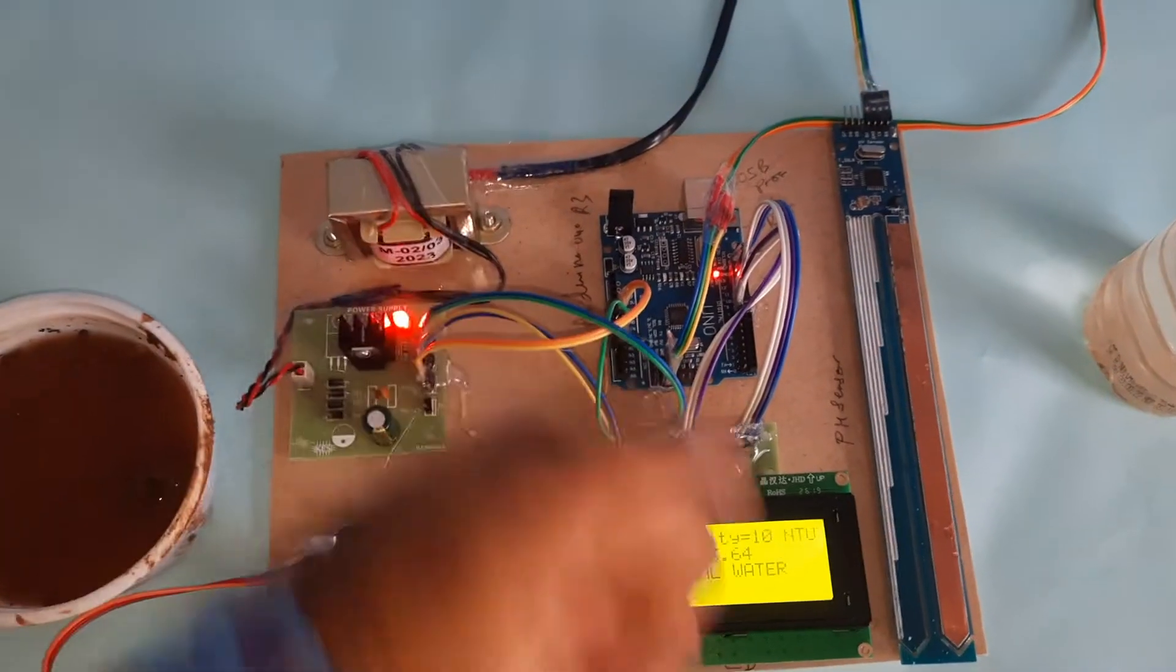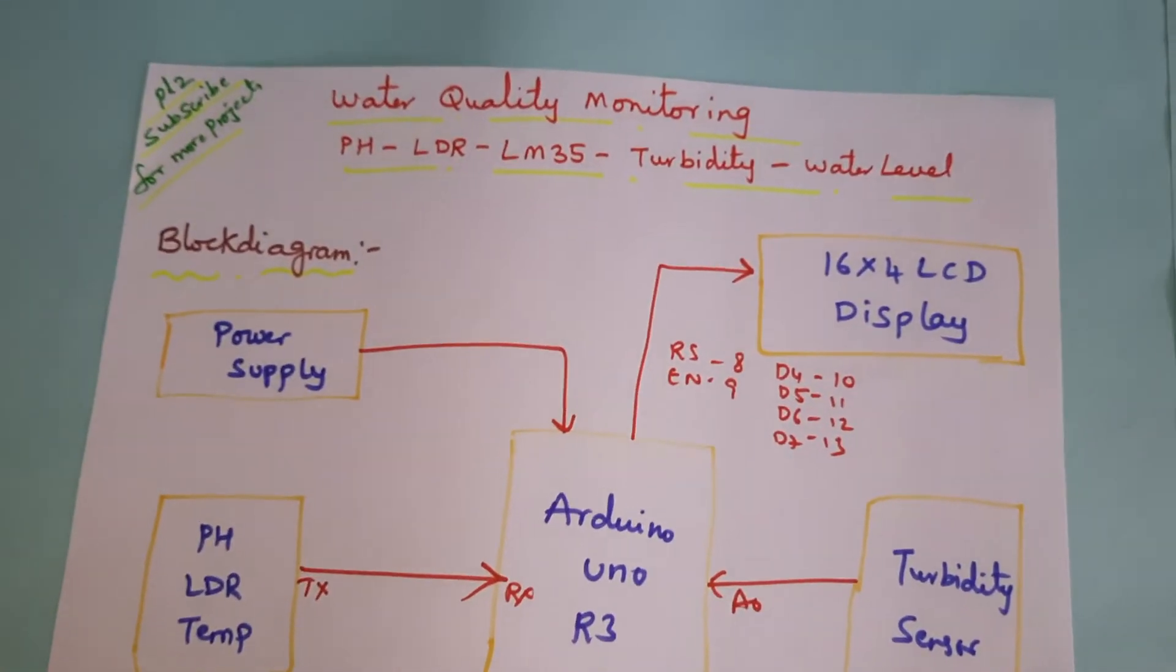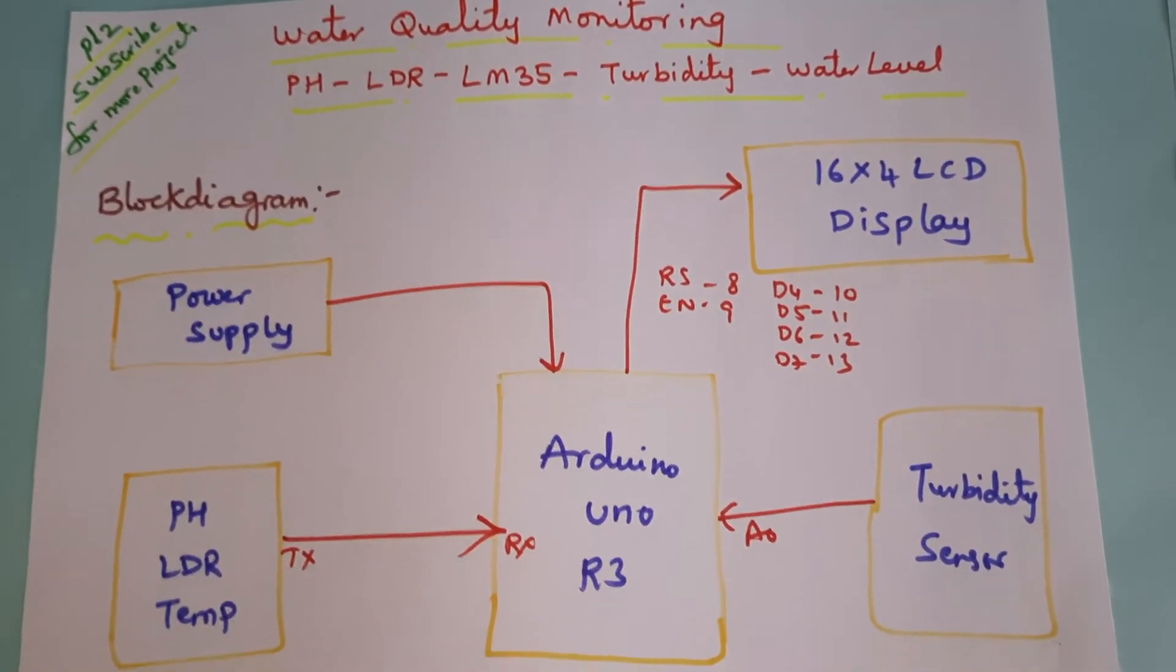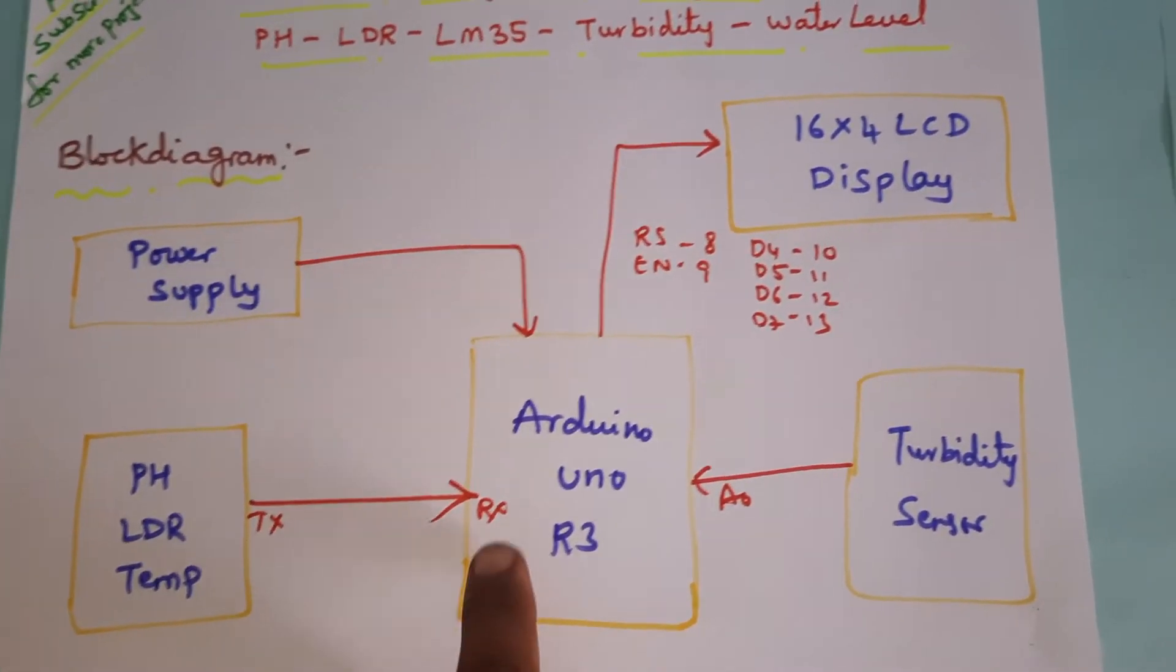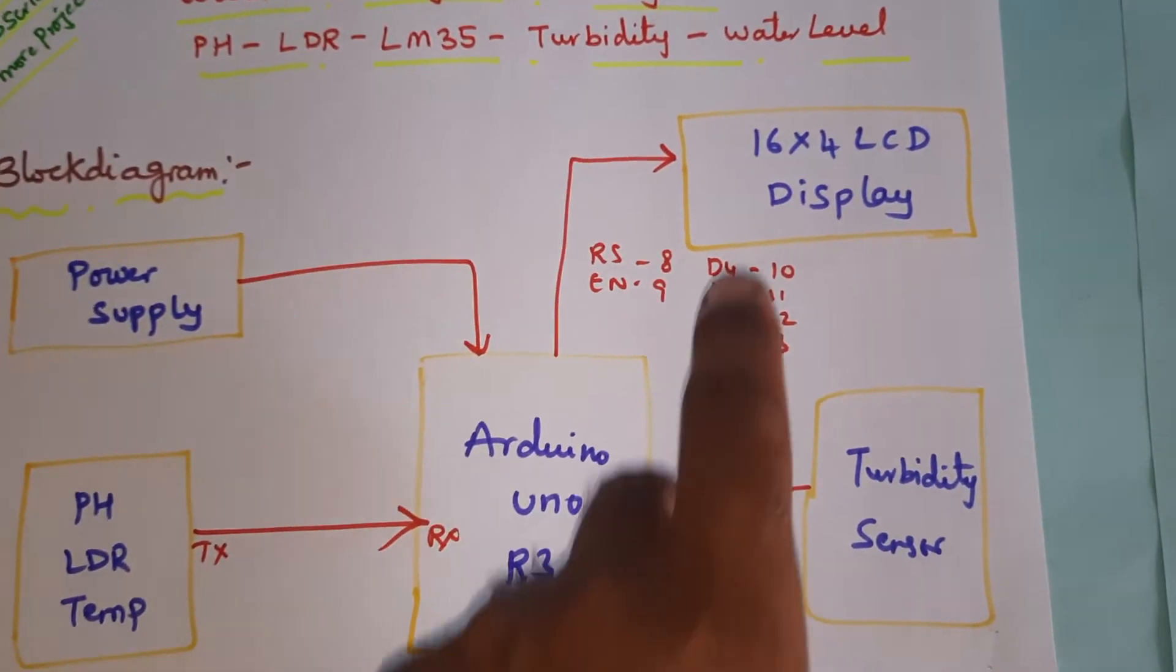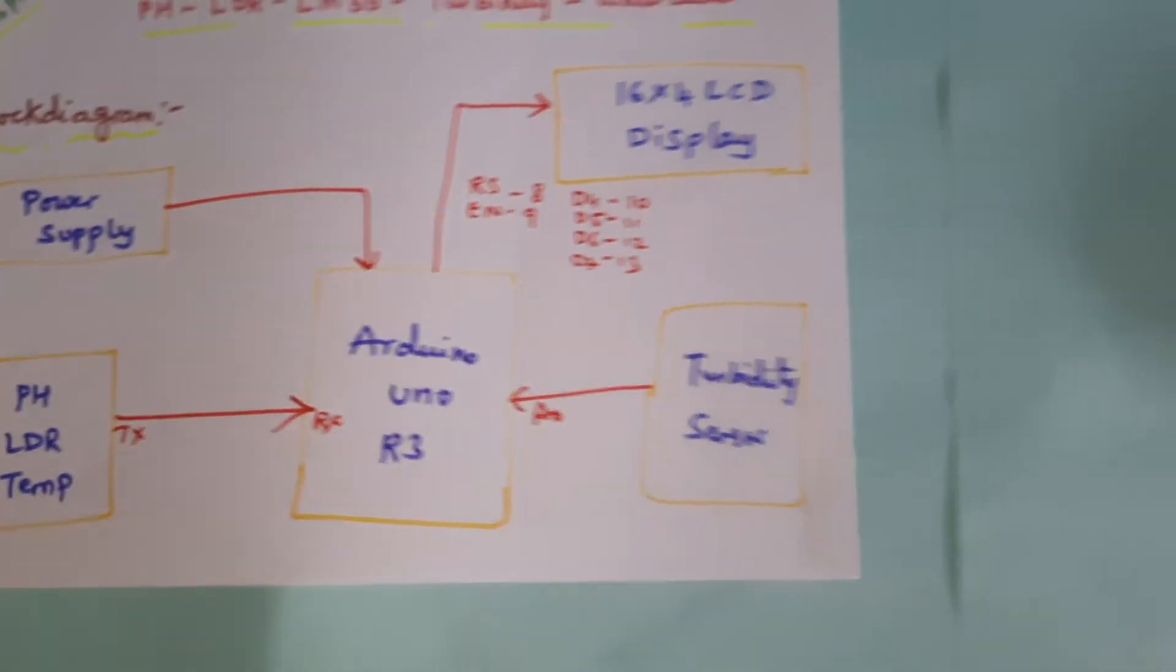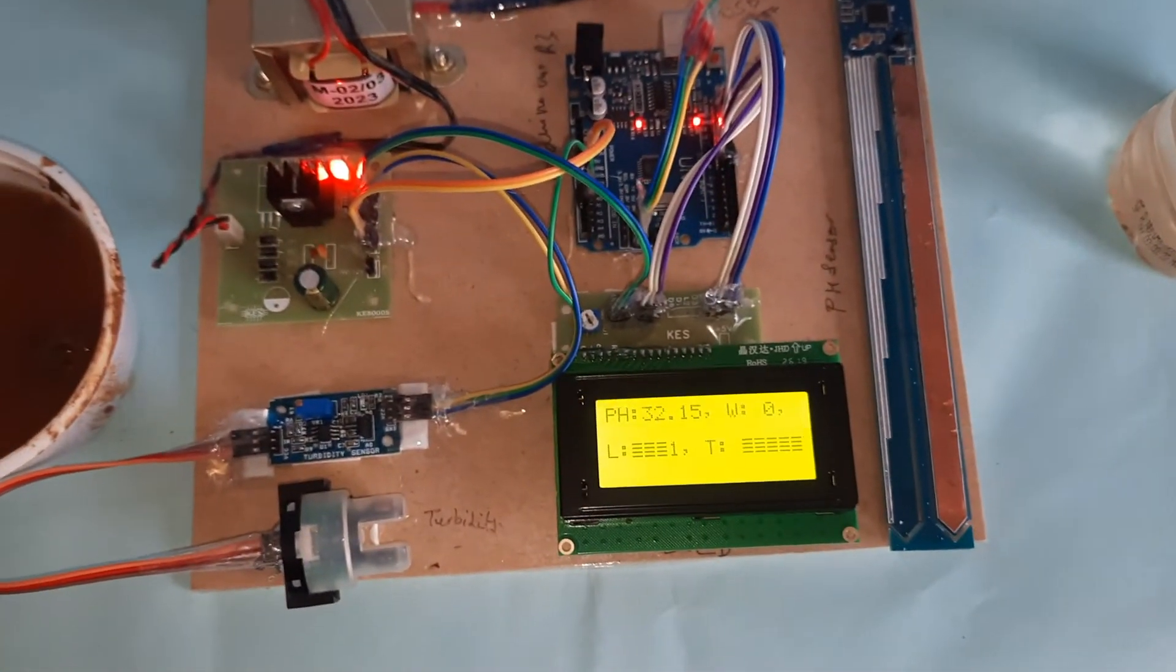Normal water quality monitoring: pH, LDR, LM35, turbidity, water level detection. All the values should be displayed on the 16x4 LCD display - only monitoring the sensor data onto the LCD display.